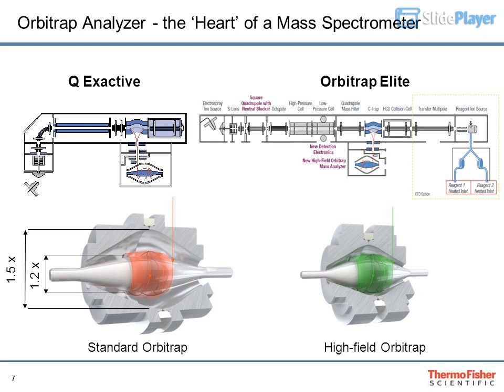This arrangement creates a higher field, making the ions go forth and back at an almost 2 times higher frequency, resulting in an almost 2 times higher resolution. And, because the little hole where the ions enter the Orbitrap also shrank, an additional lens was implemented to focus the ions more effectively into the Orbitrap, resulting in a higher ion transmission.